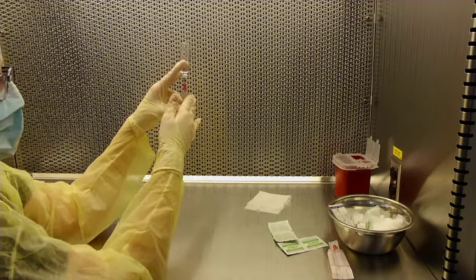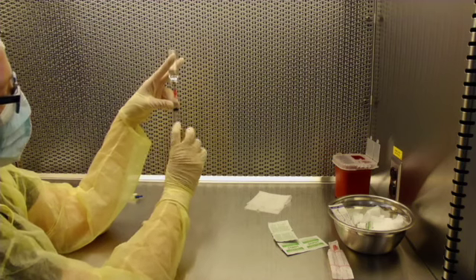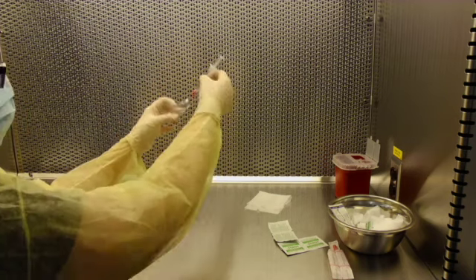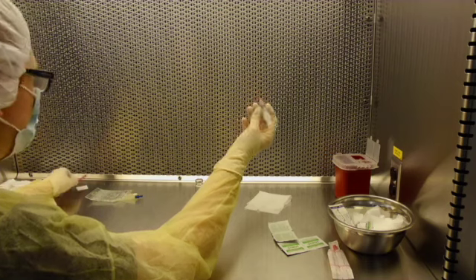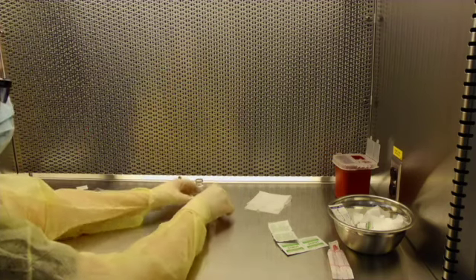Another thing to note is how to hold while trying to clear your bubbles out. You do have to clear your bubbles out of your syringe while it is still attached to your vial. While clearing your bubbles out, you still have to make sure that you're not blocking any of your critical sites. Once your bubbles are removed, you can put your vial back on the counter, safely remove and recap your needle.